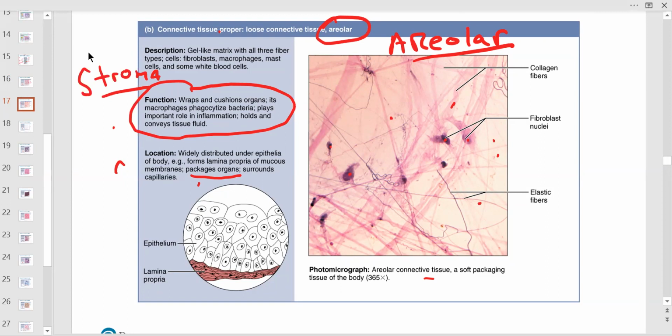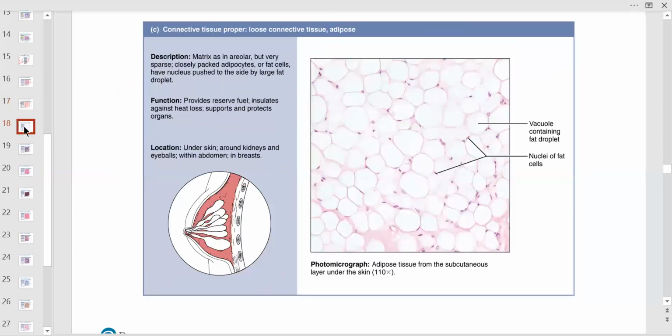All right, so even below the epithelium, even below the basement membrane, sometimes a gland is anchored by areolar connective tissue that looks kind of loose like this. So good luck with that one. That's tough. This is easy. This is an easy one. I think this is one of the easiest ones.